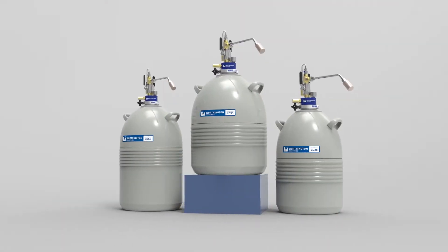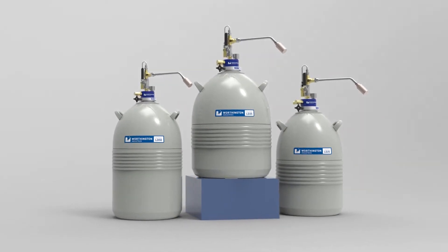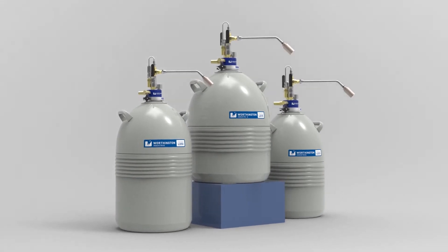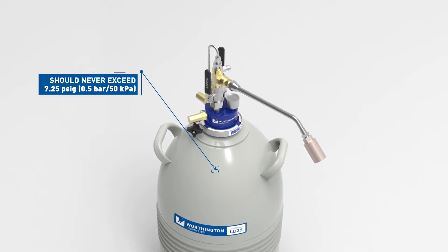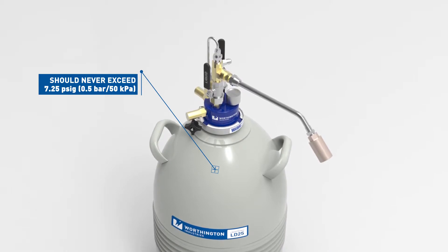Use only containers designed for low temperature liquids. Cryogenic containers should be filled slowly to minimize stresses which can damage the container. Pressure in a Dewar with liquid withdrawal device installed should never exceed 7.25 PSIG, 0.5 bar, or 50 kPa.